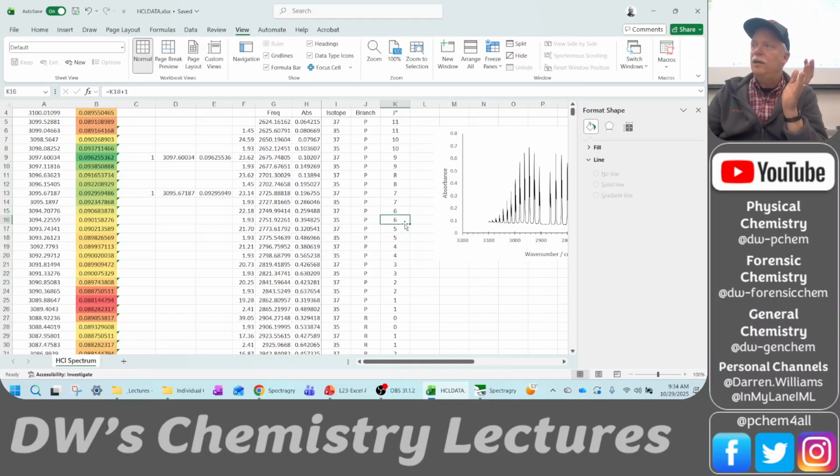Now let's see how we did. Okay, how do we do that? Well, I want to plot the frequency on the y-axis and the J value on the x-axis because I want to see if I've made some mistake or skipped a line or something like that. So we should see nice trends with our P and our R branch lines. Now, this seems really dumb what I'm about to do, okay?